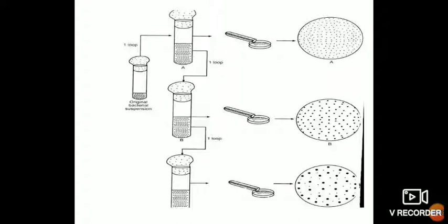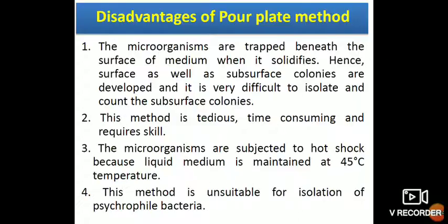So you may already be aware of doing the pour plate: mixing the media with the culture, shaking it, and pouring it onto the plate. Then after overnight you can see the colonies.